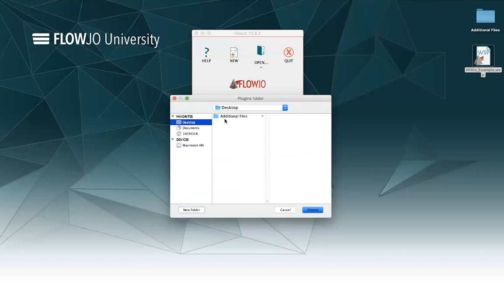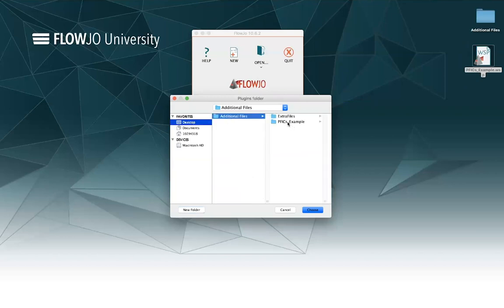I navigate my way to it — it's on my desktop in my additional files, and here's my derived parameters folder. Normally this folder is created next to the workspace; you can see it has the same name as my workspace — they're both called pfix example. So if you're looking for it and have lost it, a good place to check is where the workspace was originally saved, because it's probably in that same location.